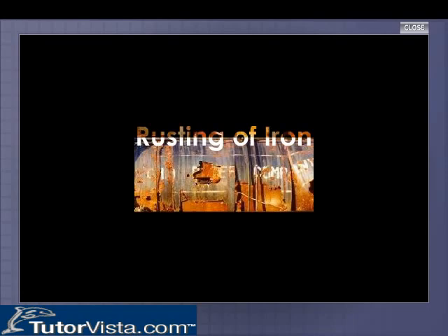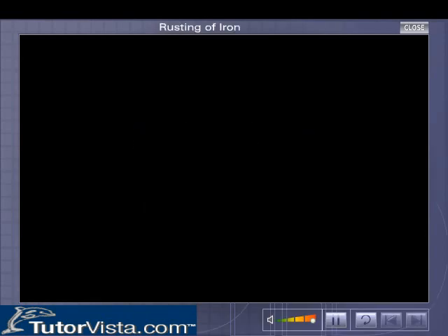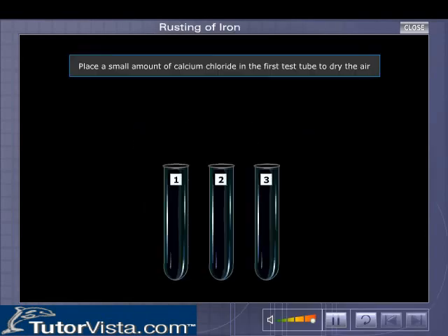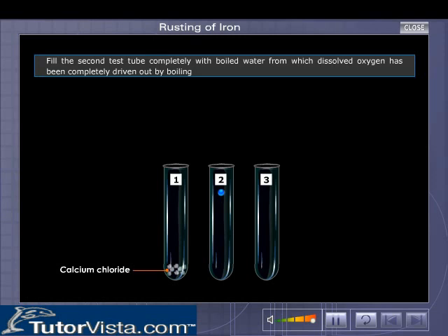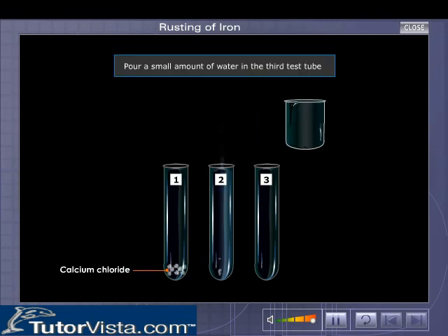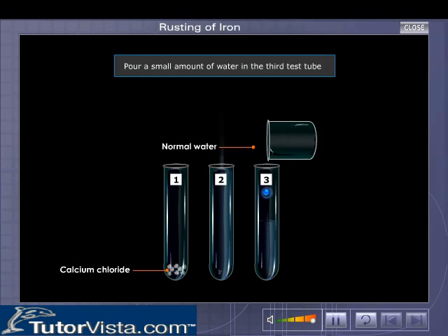Rusting of Iron. Take three test tubes and number them. Place a small amount of calcium chloride in the first test tube to dry the air. Fill the second test tube completely with boiled water from which dissolved oxygen has been completely driven out by boiling. Pour a small amount of water in the third test tube.